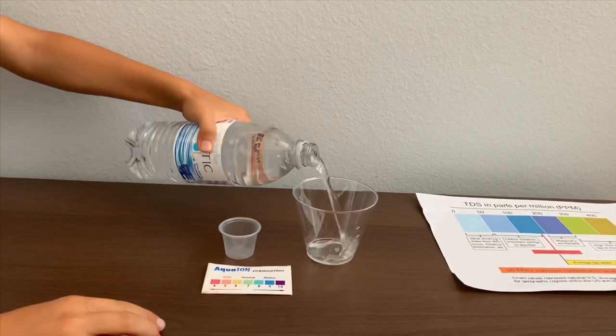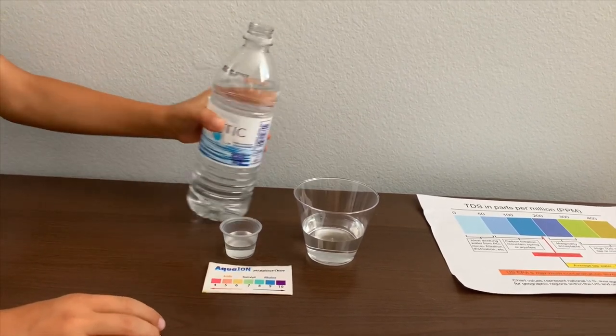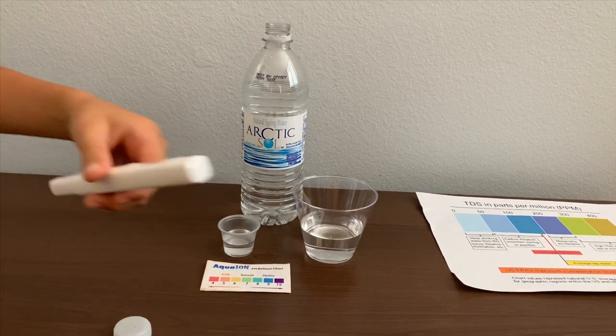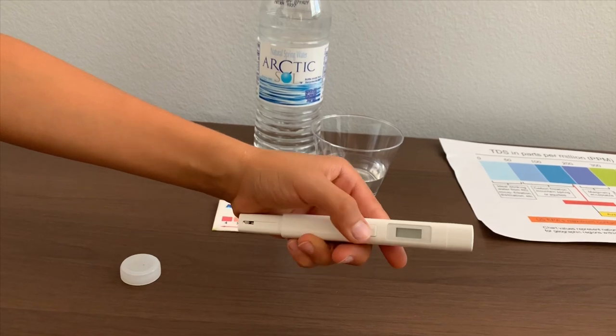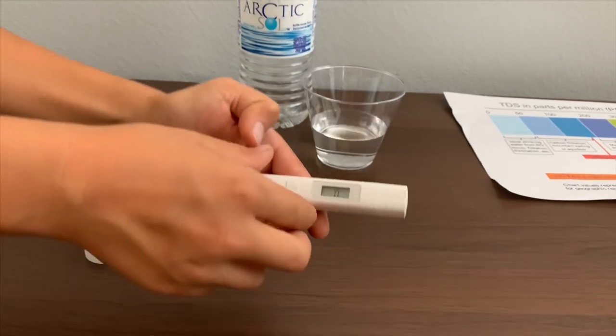Let's pour some water in. First, let's test the TDS level. If you want to buy this TDS tester, check the link down below. Turn on the TDS tester, make sure it says zero, and put it in.